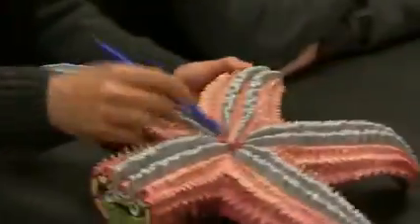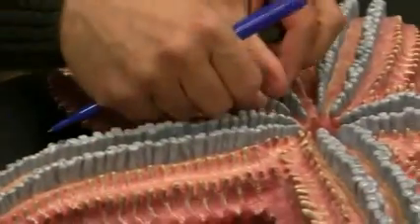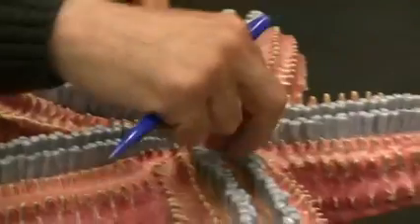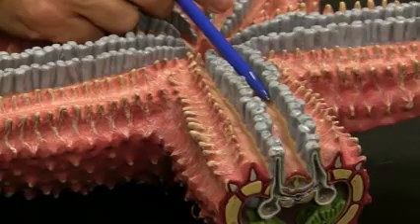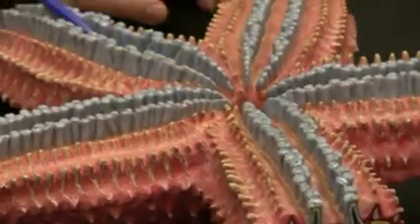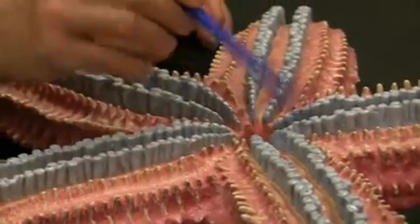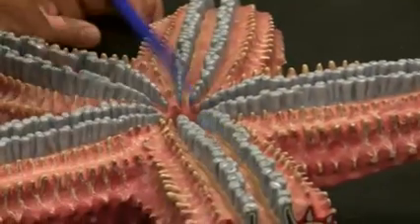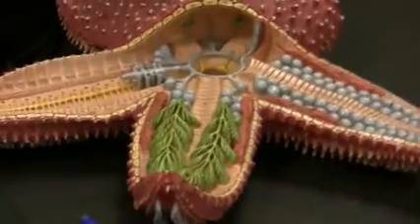Is there anything else in here I should know? Mouth. Tube feet. These are all tube feet, right? Between them is called the ambulacral groove. Kelly's looking at me: why do I have to know all of these things? When I was taking this course, same as you, I thought, why do I need to know all of this? When I grew up, I realized I did need it.